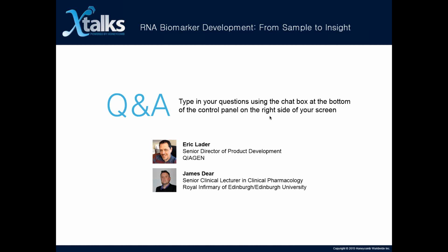The problem becomes when you're looking to do a screen with only a couple of targets, then you are required to try to develop something that can be a normalizer for any one large experiment. You can figure that out if you have a larger data set, but I don't think there is such a thing really. So I think that you're right. Maybe expressing it as copies per microliter of serum might be the way to do it. It's tough.